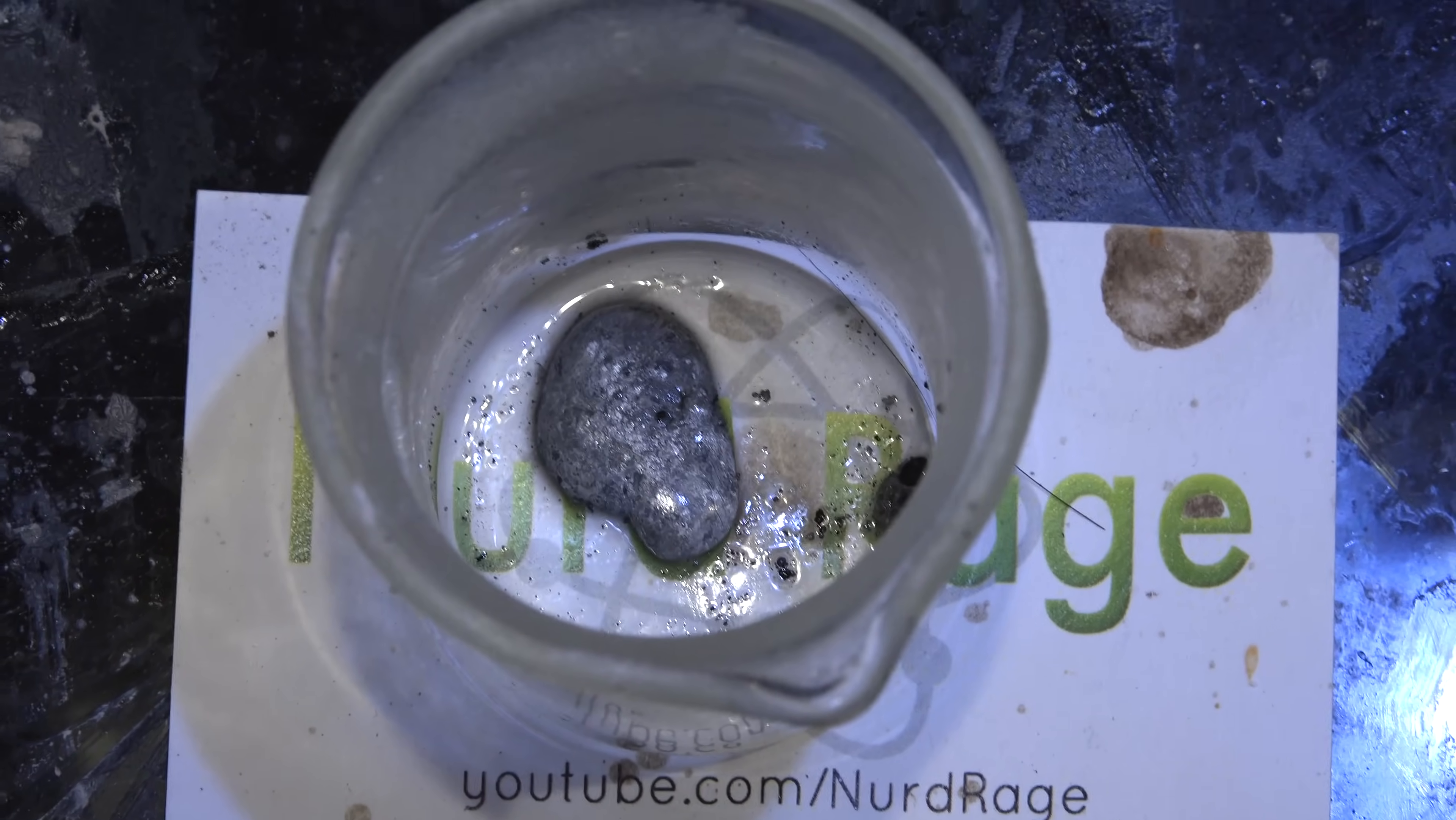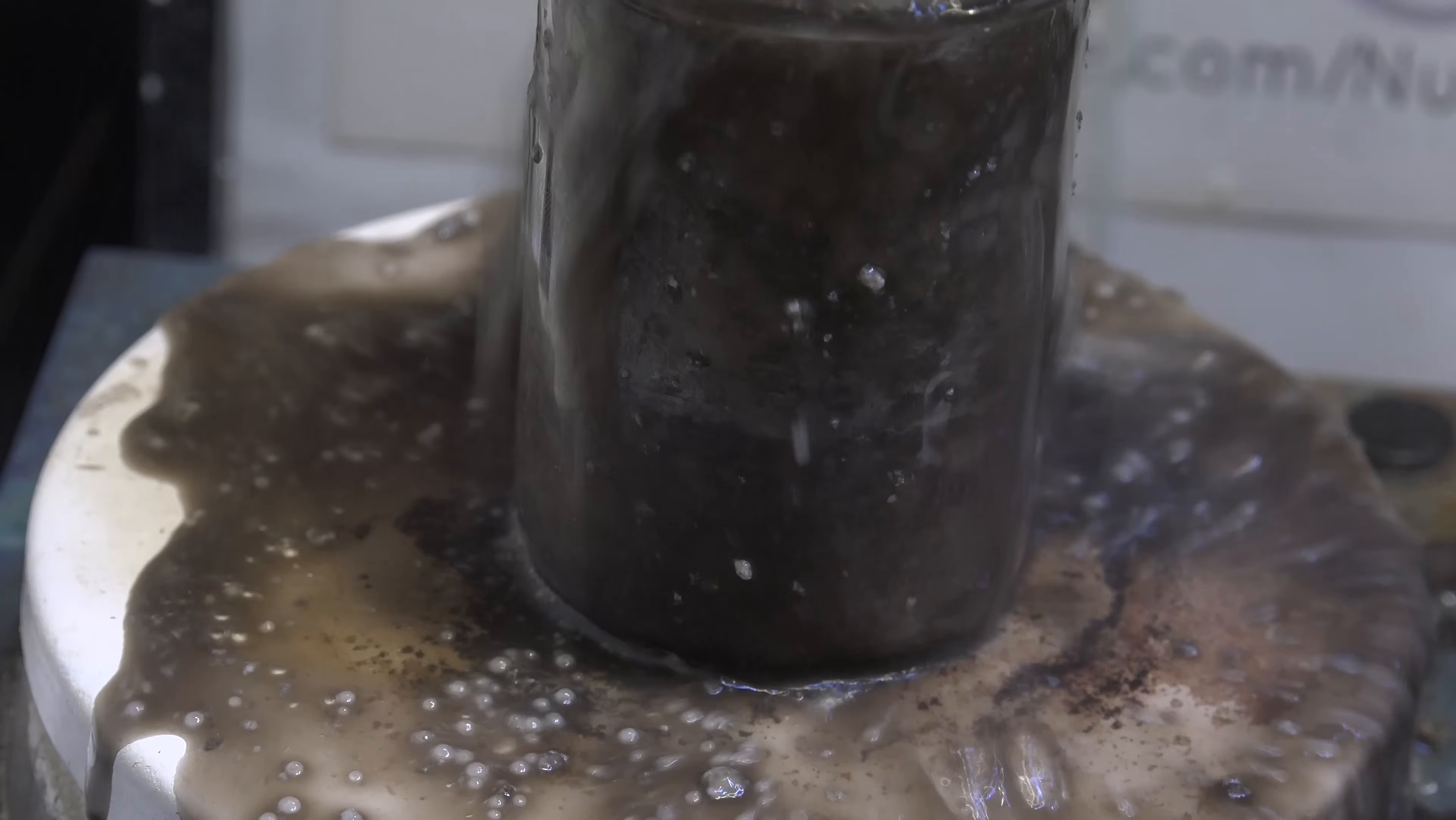It doesn't look like much but keep in mind that this was what the sodium hydroxide method could not recover. This was done on the waste. And this method was also a failure.